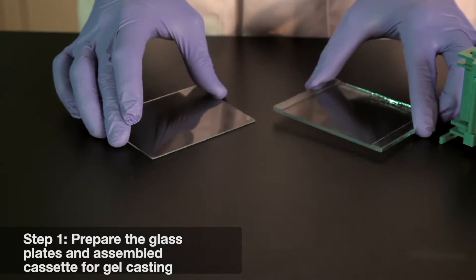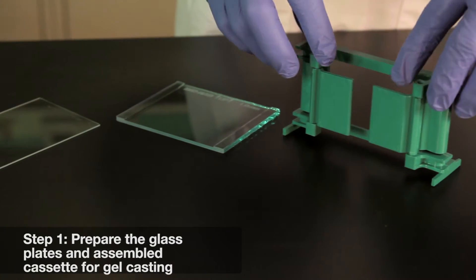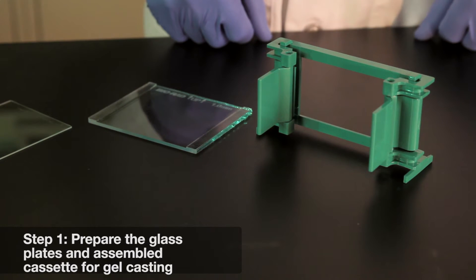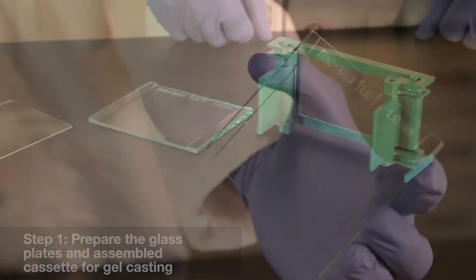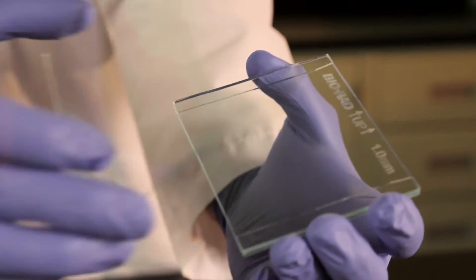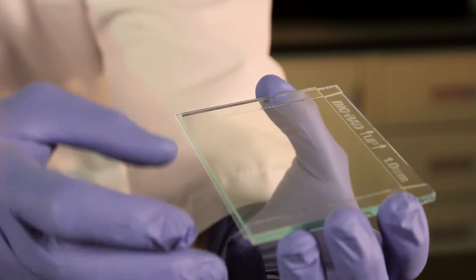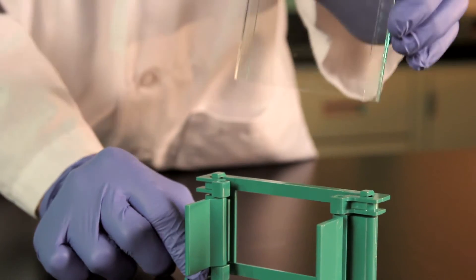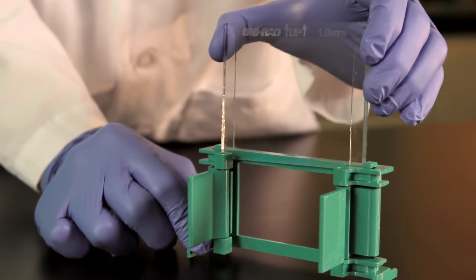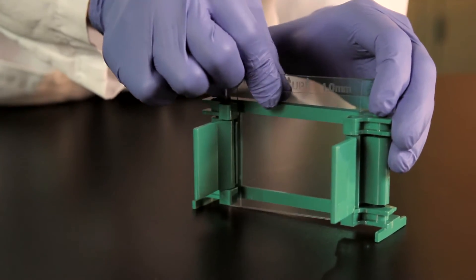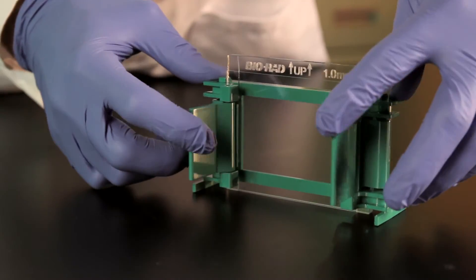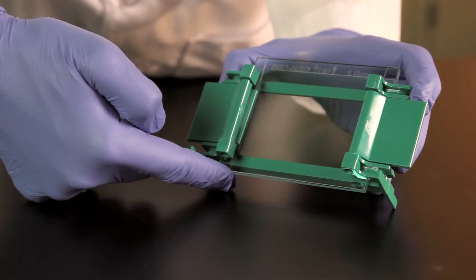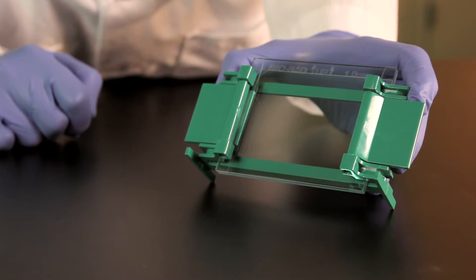The first step is to ensure that all glass plates are clean and dry. Place the casting frame upright on a flat surface with the pressure cams in the open position. Select a spacer plate of the desired gel thickness and place a short plate on top. Slide the two glass plates into the casting frame, ensuring that both plates are flush on a level surface to avoid leakage. Engage the pressure cams to lock the glass plates in place and check once more that the bottom of both glass plates are flush.